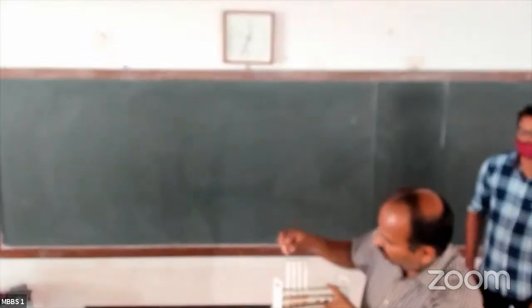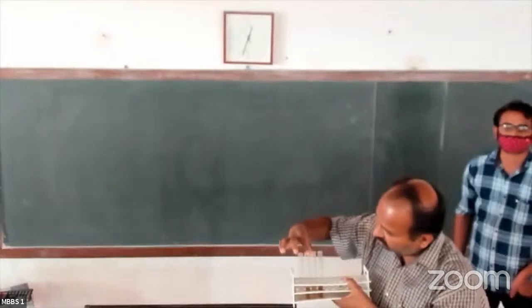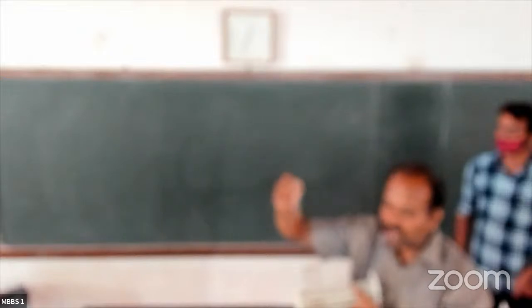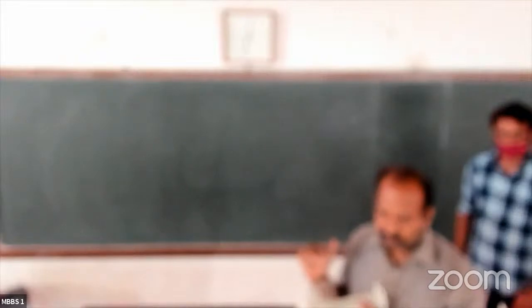Then this is the color of control. Then this is the color of standard. And last is the color of unknown. This color depends mostly on how much phenol is liberated by the action of the alkaline phosphatase enzyme. And all of you know how to take the readings of these colors by colorimetry.